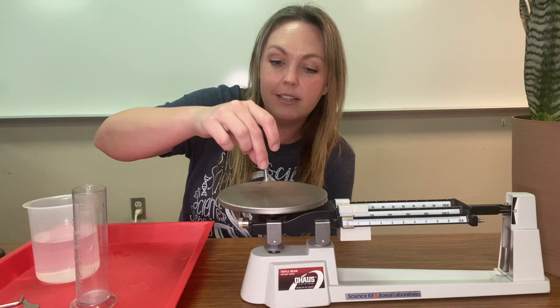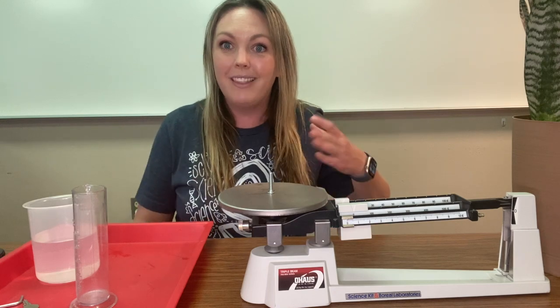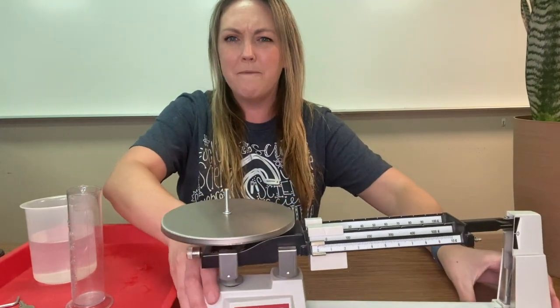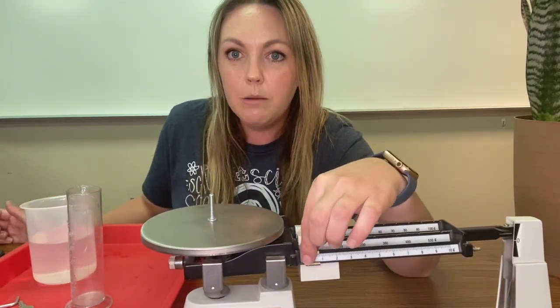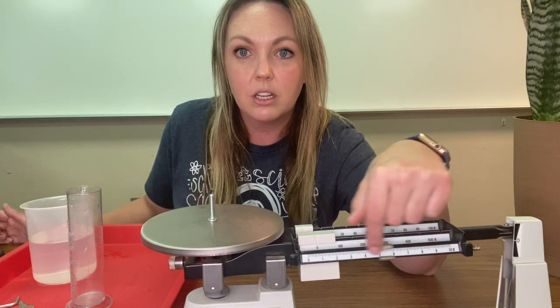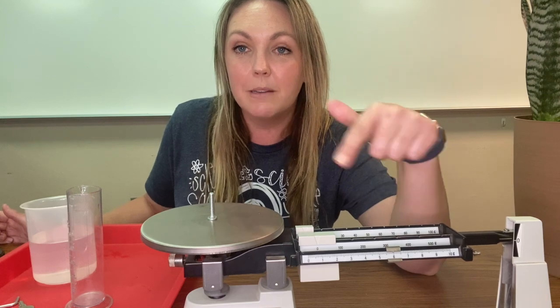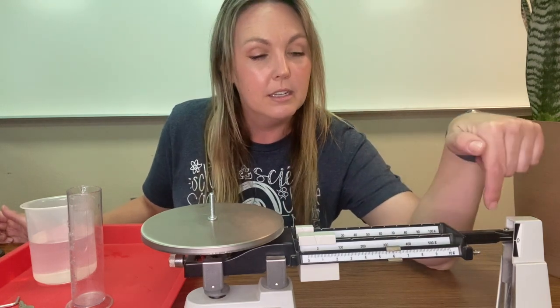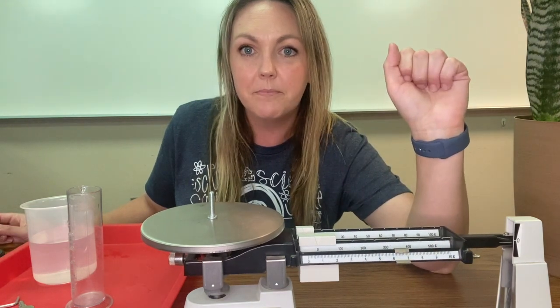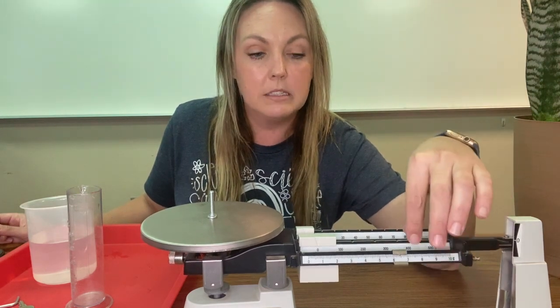I'm going to set this in the center of the triple beam balance and you will notice a change. This is heavier than zero grams — it has more mass. So you want to start on the very bottom beam and move the weight up as close as I can, until we notice a change. We're going to keep going just a little bit.